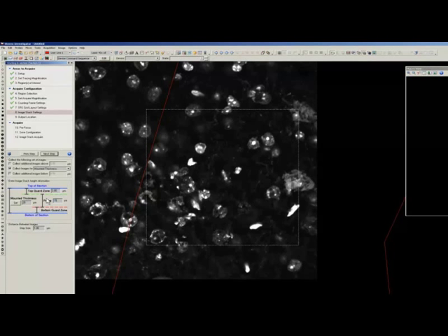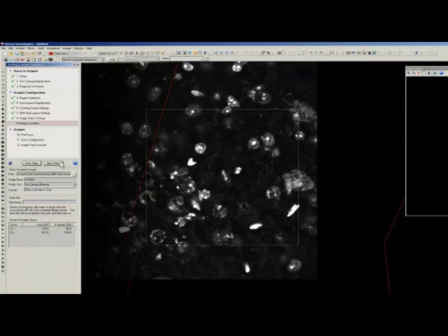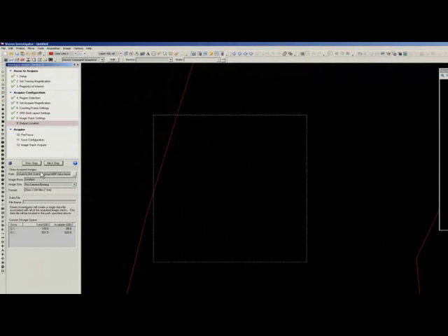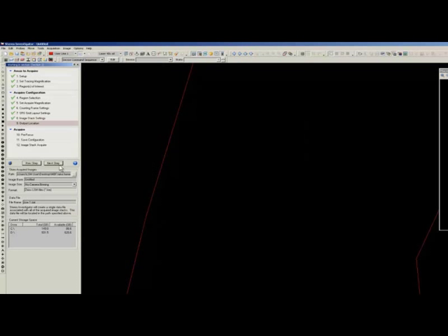Correct. So after we have set up our stereological parameters, the next step allows us to save our images and allows us to name both our images and our DAT files. This is important because it's going to automatically assign a name to each of those image stacks that we're going to acquire.